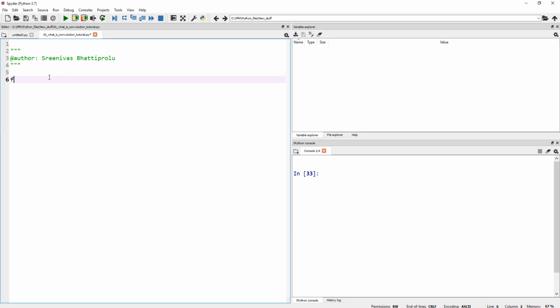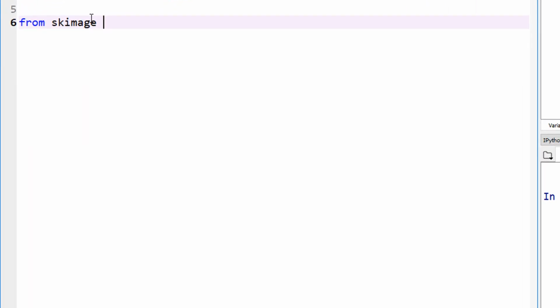So let's go ahead and import our image, which means let's use from skimage import io. Again, there are many ways of importing images. You can use OpenCV. I've covered this in one of the previous tutorials. In fact, part of this tutorial has been already covered, but after meeting quite a few of you in the field, I'm recording this again to reinforce this message.